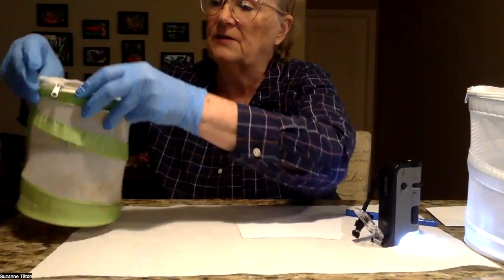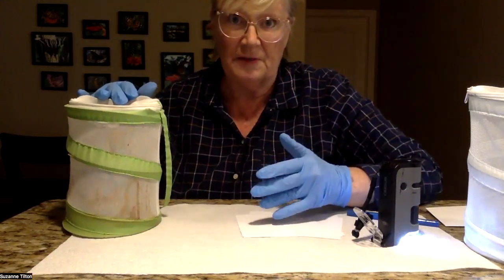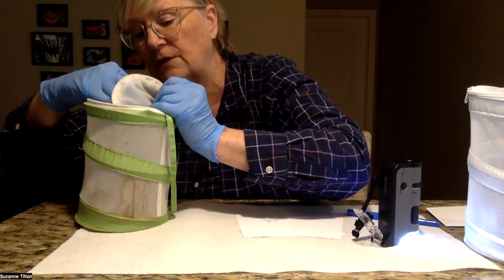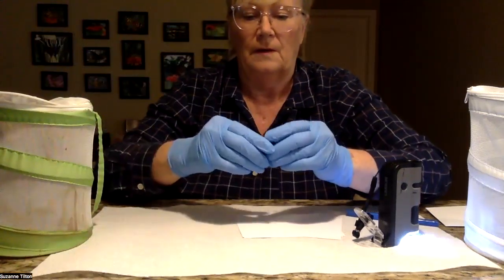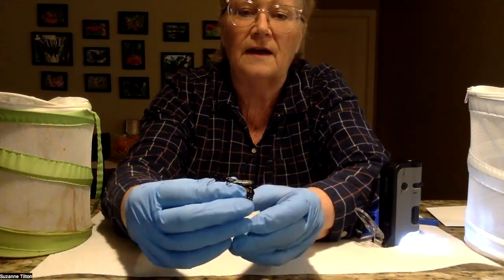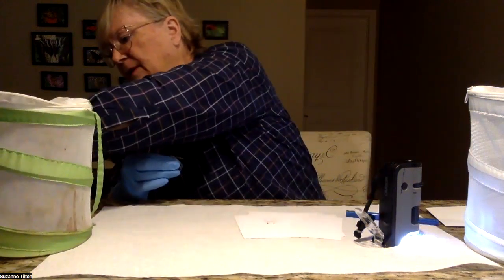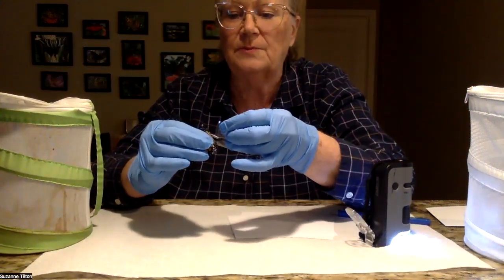I'm going to take out one of these butterflies. I like to wear gloves because if there is OE on the butterflies, this will help prevent the spread. I try and grab them with both wings closed. You want to hold the butterfly so that the abdomen extends and also to prevent the wings from flapping around. Then I'm going to take my tape — just a little piece of tape — and I'm going to place it on the abdomen.